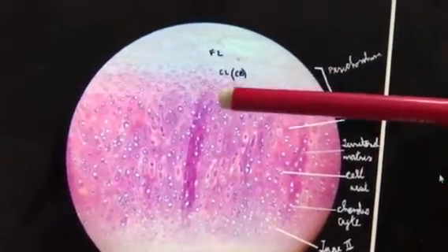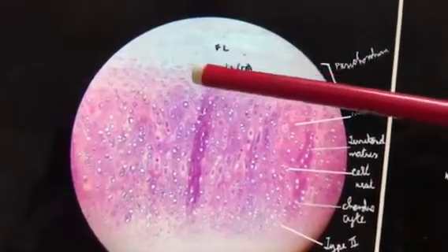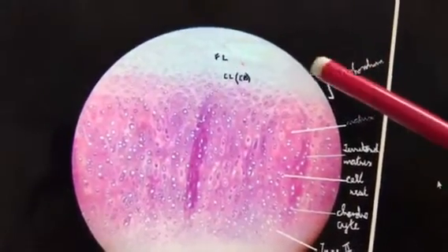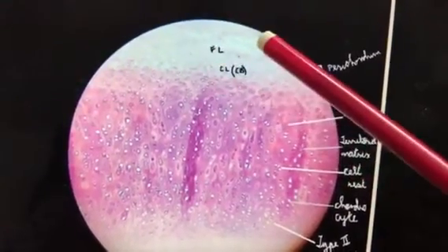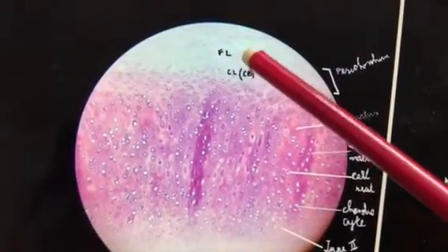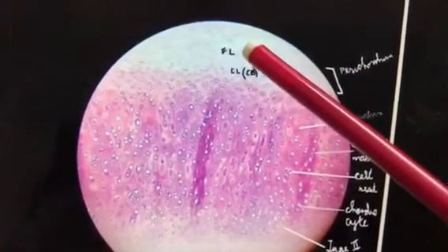In the hyaline cartilage, when you see the structure, the first question we will ask is, what is this? So you should answer it. This is the perichondrium. What are the two layers you get? One is the outer fibrous layer. When you talk about the outer fibrous layer, we'll ask what fibers. It contains type 1 collagen fibers.